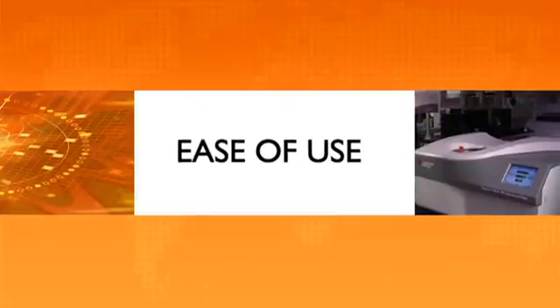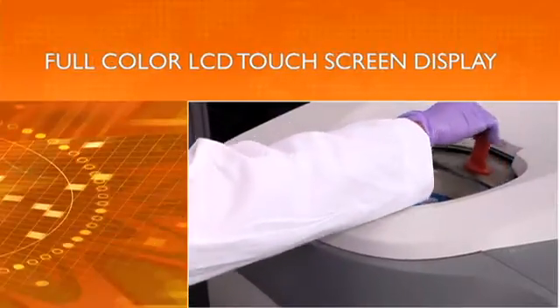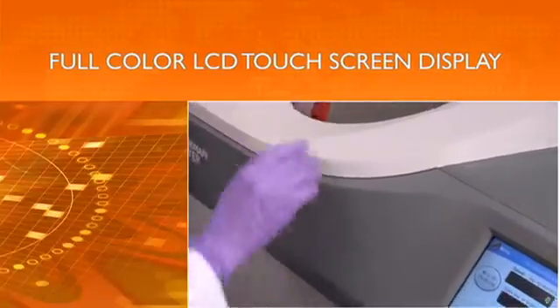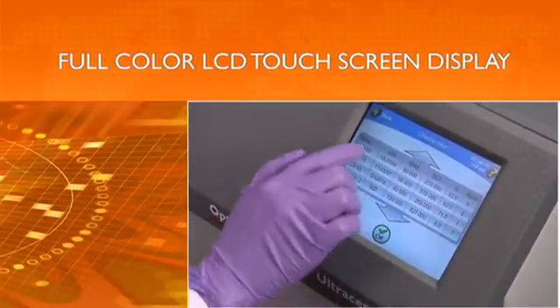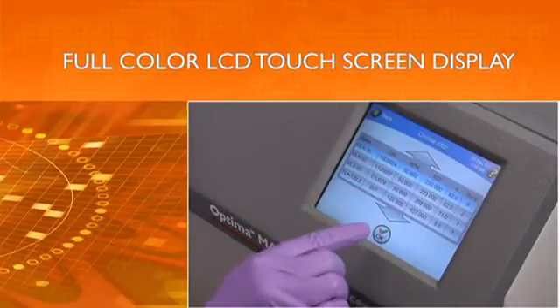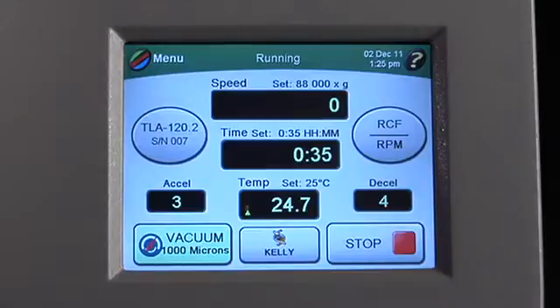When it comes to ease of use, nothing compares with the Optima Maxx series. It features a full-color LCD touchscreen display that's easy to read and navigate, with an intuitive graphical interface and on-screen help. The touchscreen control features easy-to-read displays for gauging real-time speed, time, and temperature.